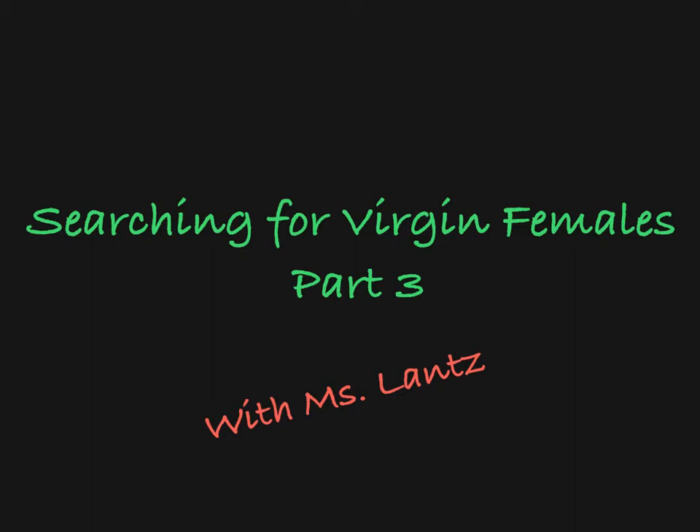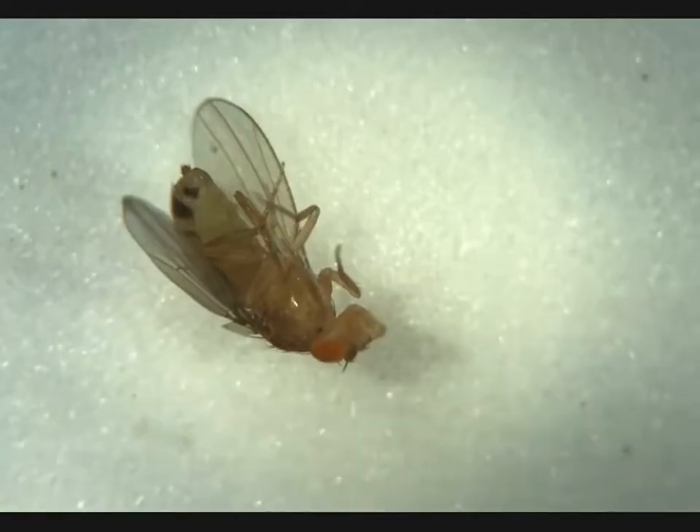In this video, we'll be searching through a group of flies looking for virgin females. So let's get started.